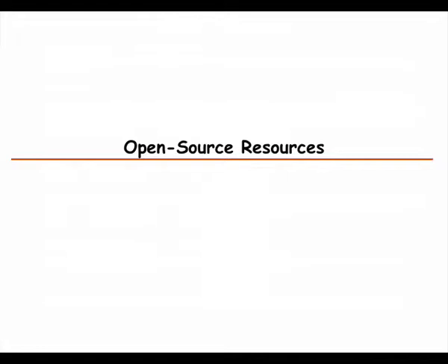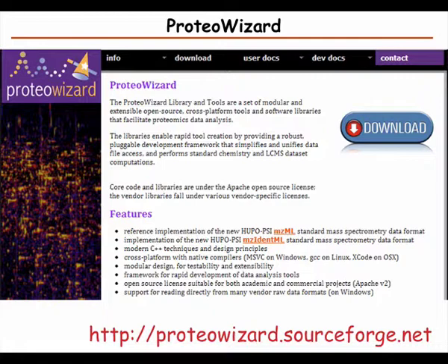And then there are lots of software resources, and so Jessica talked about MaxQuant, which is free to use, and it provides a very useful service, and there are lots of other ones also.